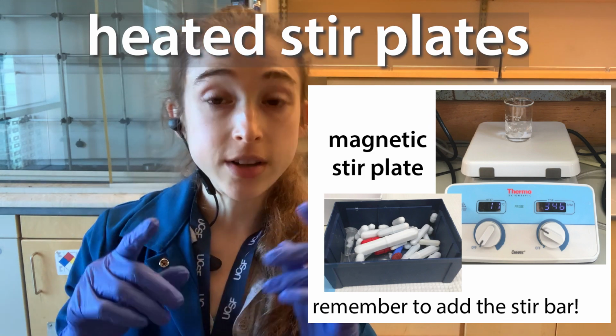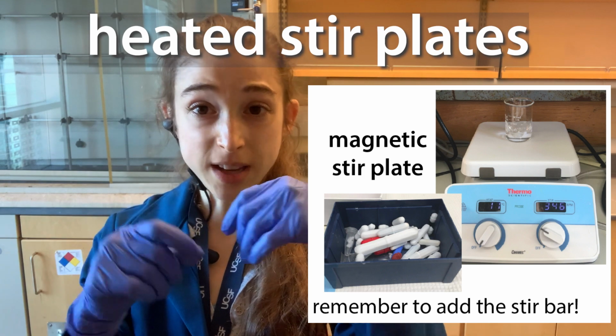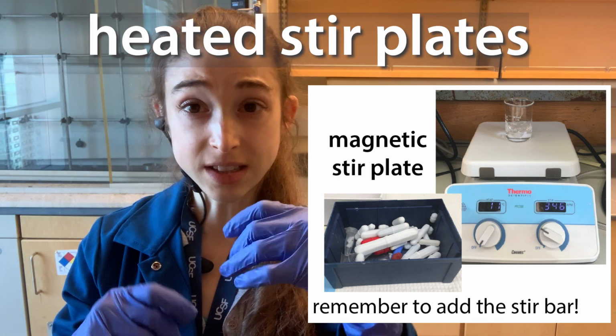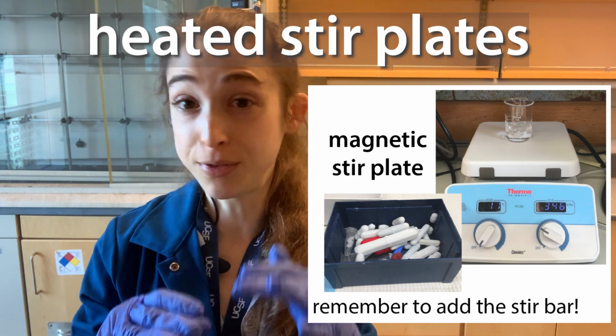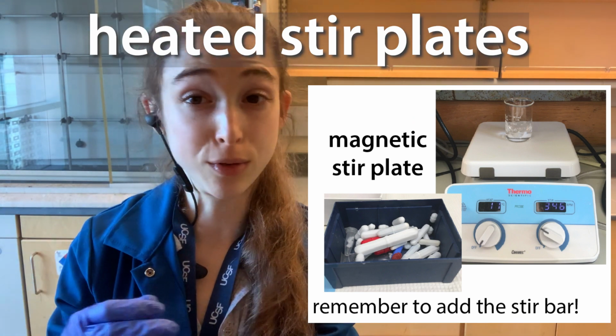But you need to make sure that you're not heating things up if you don't want to be heating things up. The heat knob can easily get knocked, so make sure that you don't knock it if you don't want it on. Sometimes you might even want to stick a piece of tape on it. I did that at my old lab.